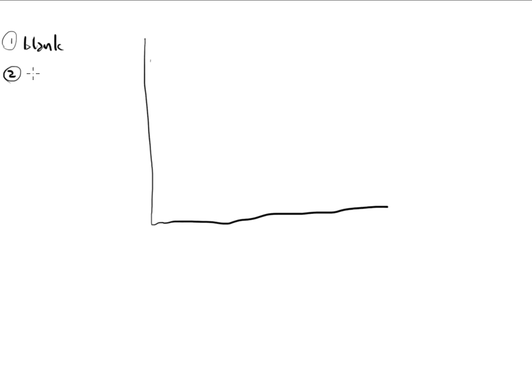All right, guys, so we're back and we're getting ready to talk more details about calibration curves. And in this video, what I want to talk about is the construction of the curve itself. Now, I know that I told you to run a blank every single time, for the machine, and include that in your calibration curve. And then we said we need 3 standards minimum, and recommended is going to be 5 standards.